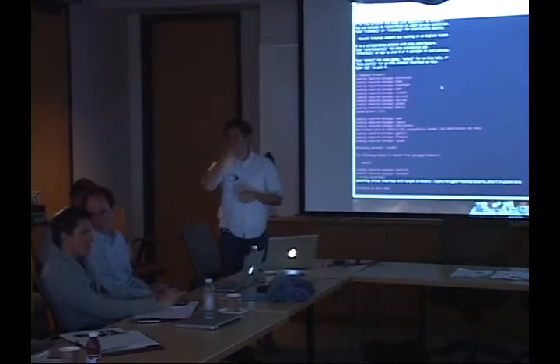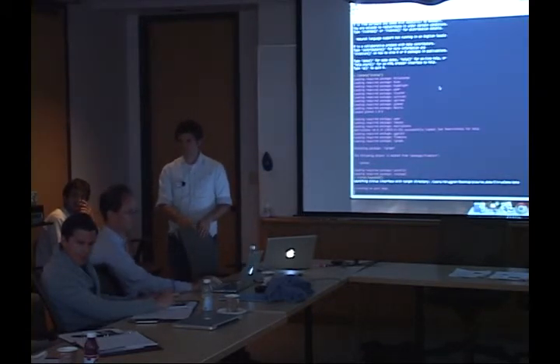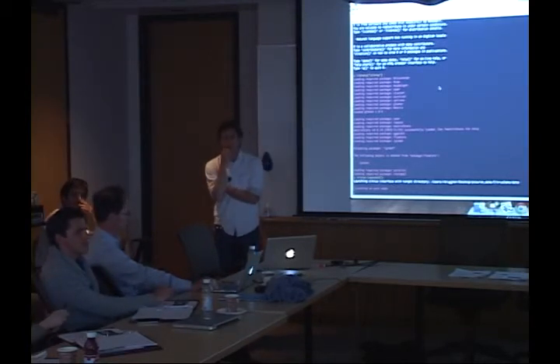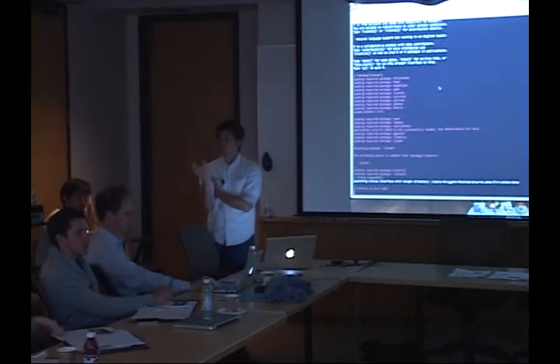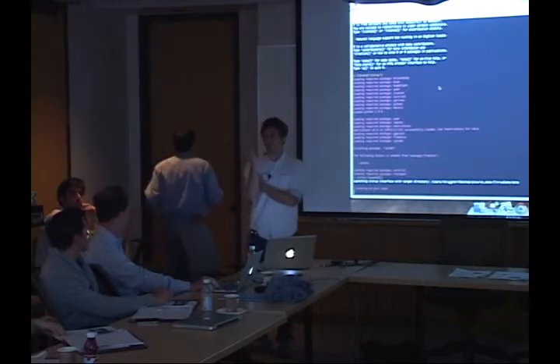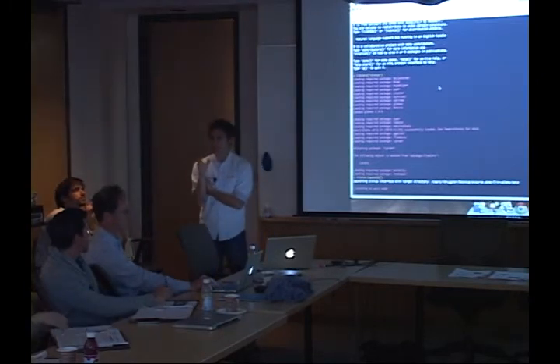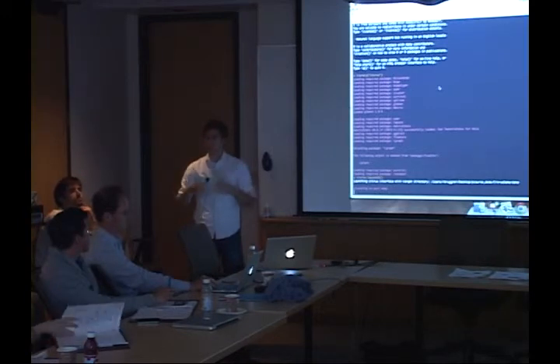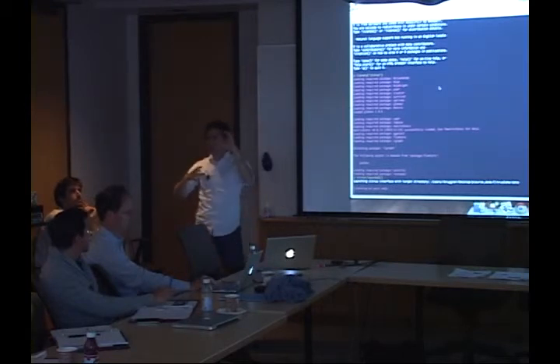Yes? Can you talk a little more about normalization? If you have enough variation day to day, can you just not actually be able to detect real differences as well, or are you just going to pick up artifacts? So that sort of depends on how the variation is manifested in the effect that you're trying to quantify. If you have lots of variation in your staining of your surface markers, when you perform the clustering, things that are CD4 T cells in one patient might appear in a different multidimensional space.